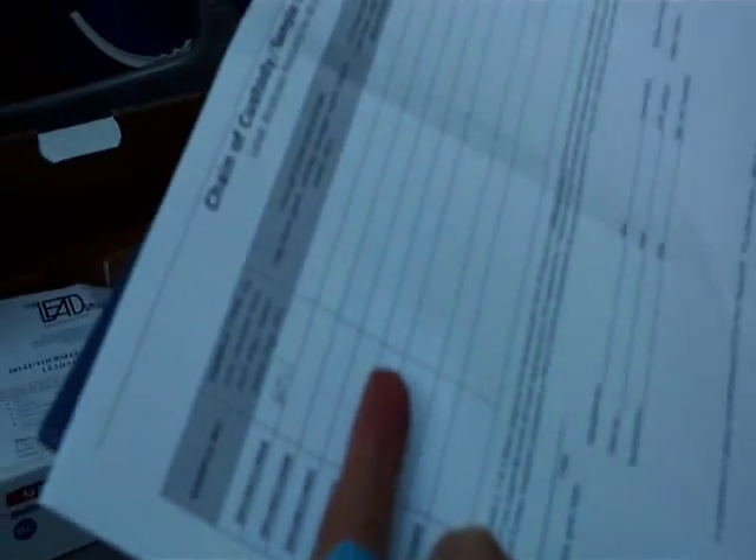We're going to type all this later and email it back to the Lead Group, but for the moment while we're out in the field, we're writing by hand. The sample location is just off the back deck, and this is the place where the child mostly plays. All we need to do is collect a small amount of soil in this sample bottle.